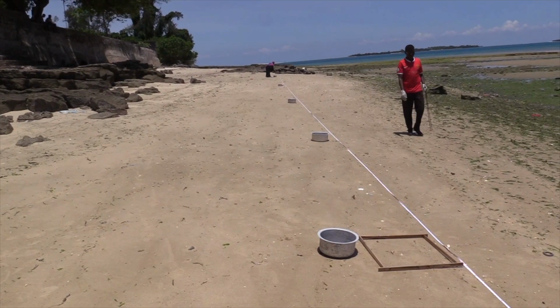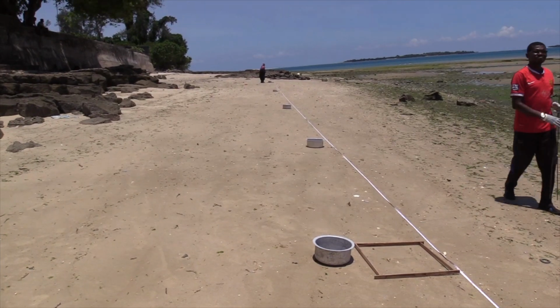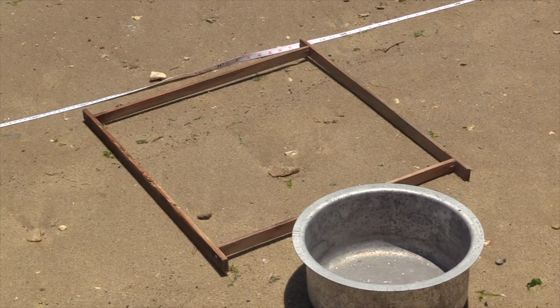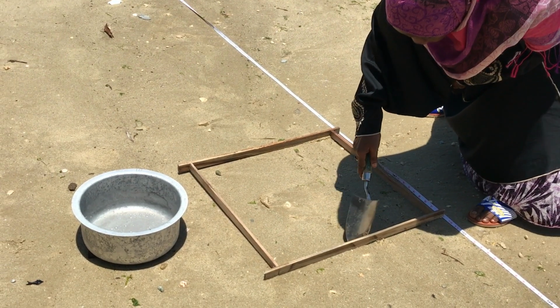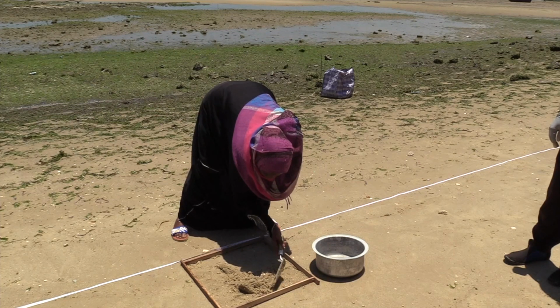Inside each transect, we take replicates. There should be 5 replicates in each transect. So we use the quadrant that I mentioned before, which is 50 by 50 centimeters, within our transect. The quadrant should be marked to a depth of about 2 centimeters into the sand, and not more than that.